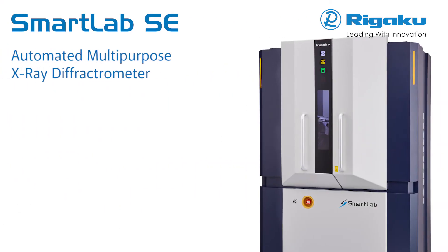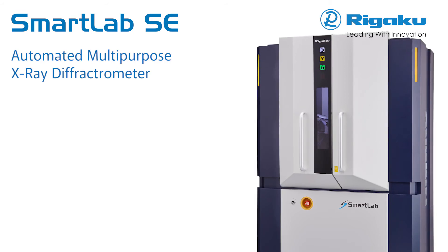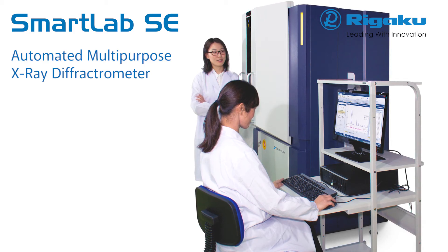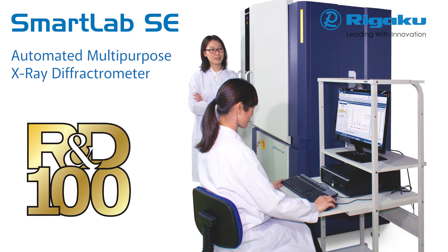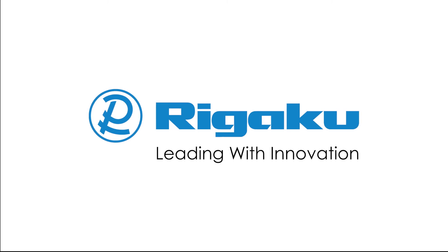SmartLab SE offers a highly versatile state-of-the-art multipurpose X-ray diffraction system with built-in intelligent guidance. Continued refinement of the original ease-of-use SmartLab features that resulted in the prestigious R&D 100 Award delivers best-in-class analytical performance and unparalleled ease of use. Rigaku — leading with innovation.